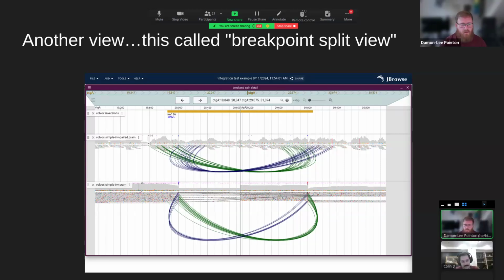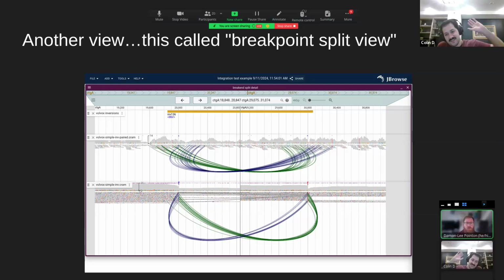Is there going to be any more ongoing support for, I think Yumi has probably brought this up with you before, actually, support for text files and spreadsheets in the browser? Because obviously we can import a text file and have it displayed, but as it, have it come up as a track. Okay, so the specific feature request is convert a spreadsheet like CSV to a track.